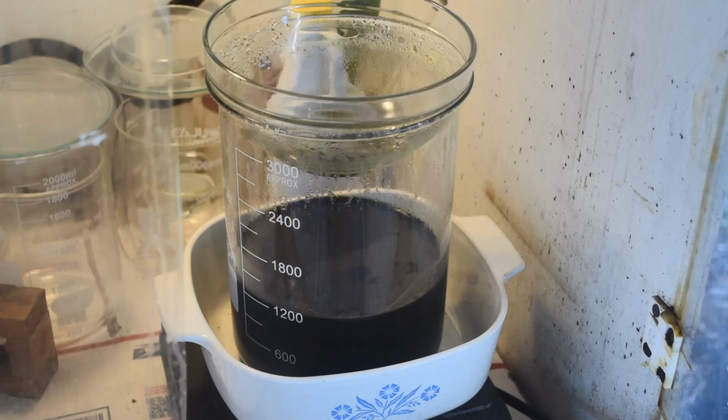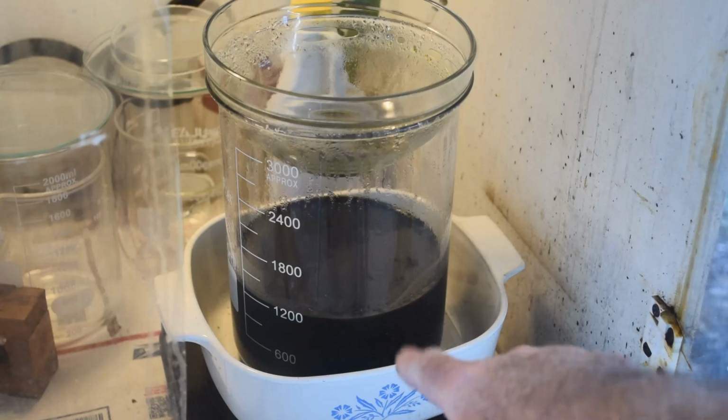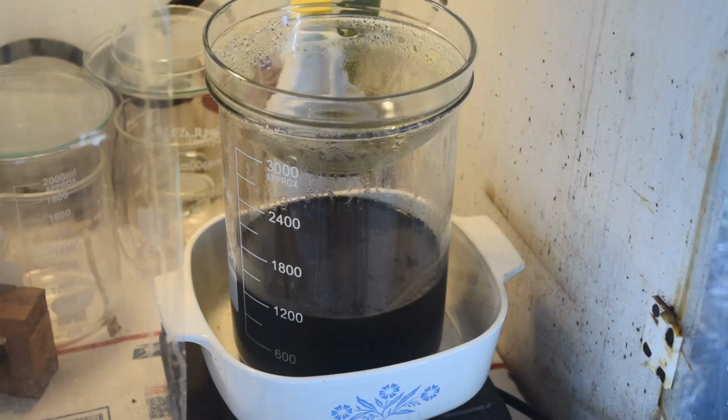But I think we're going to call a halt to this experiment just because it's been going on for so long. And I'm going to have some time to work on this. I think I'm going to let this go the rest of this afternoon and leave it overnight. And tomorrow I'm going to decant off this liquid and we'll pick up back in the fume hood after I've decanted off this liquid, and we will start treating this with other stuff.